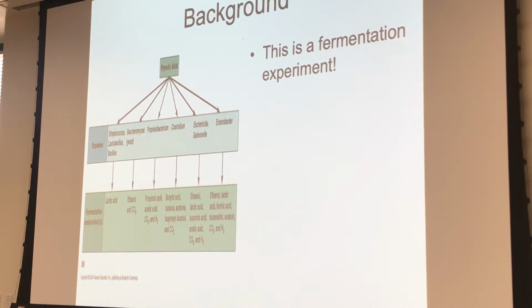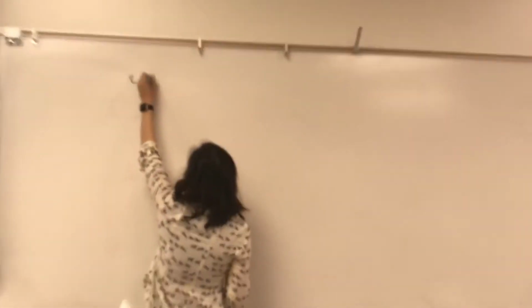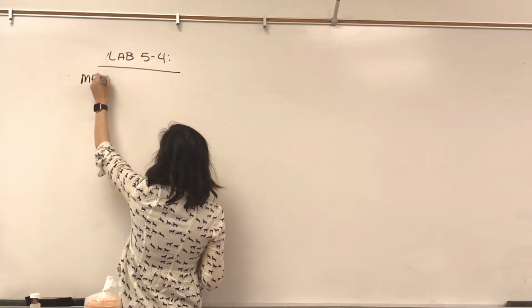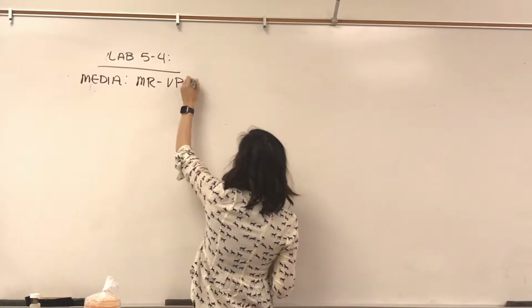So let's draw this out. So this is lab 5.4. And let's see, when you grabbed your media on the cart, we called it MRVP broth.